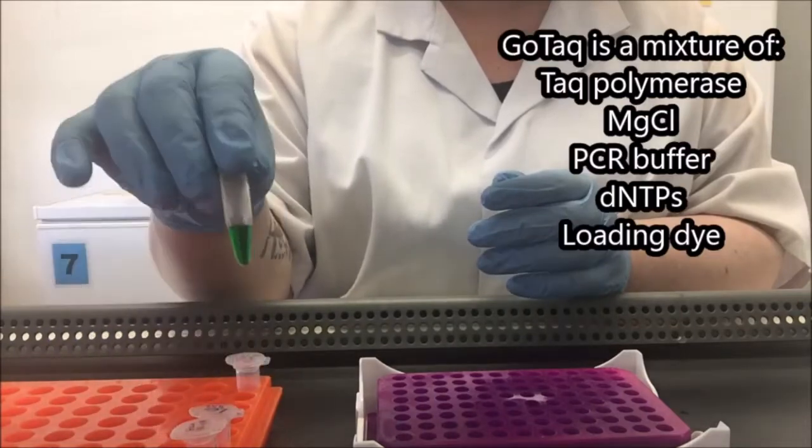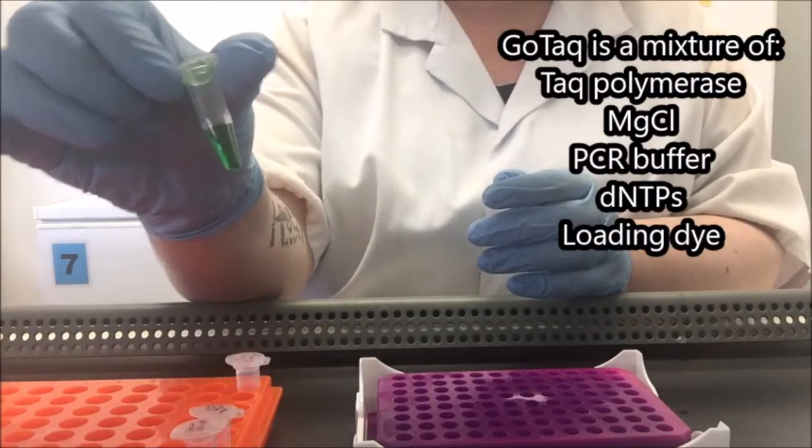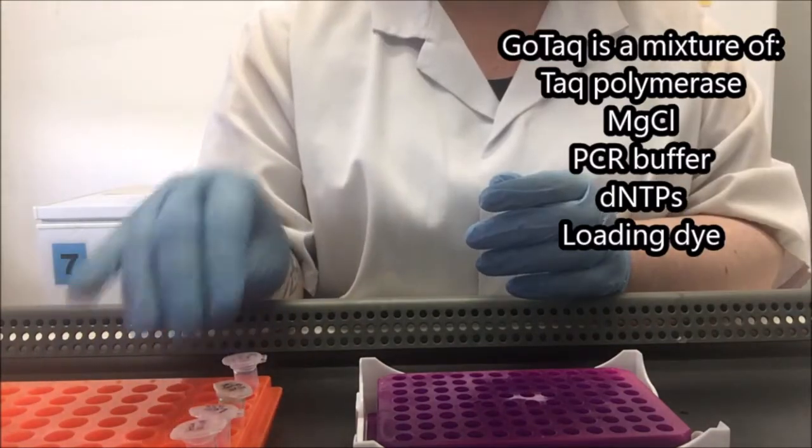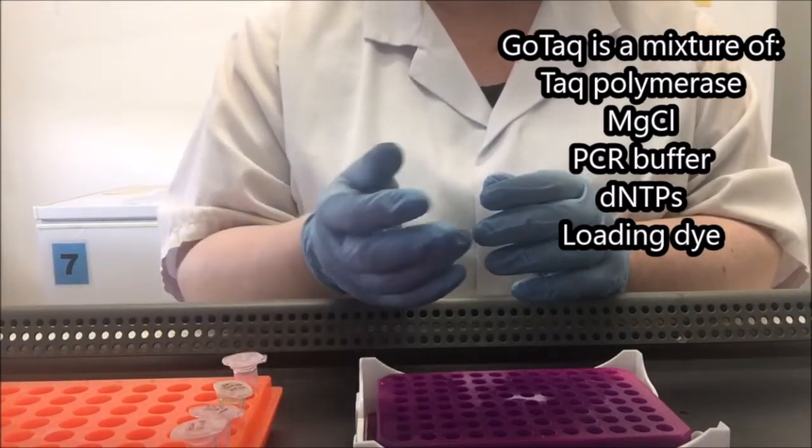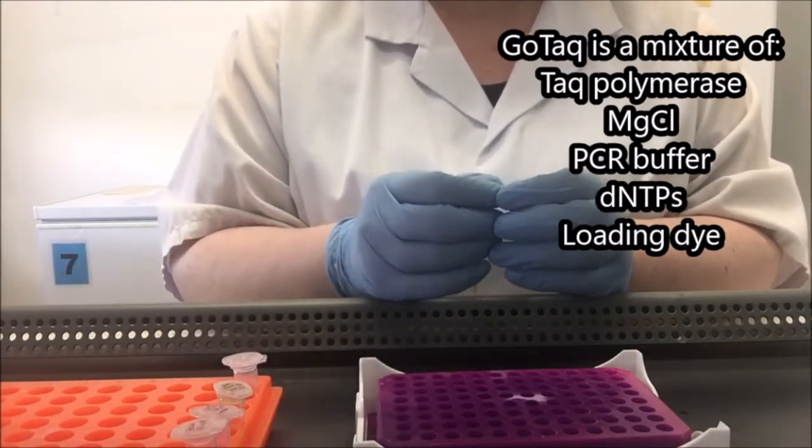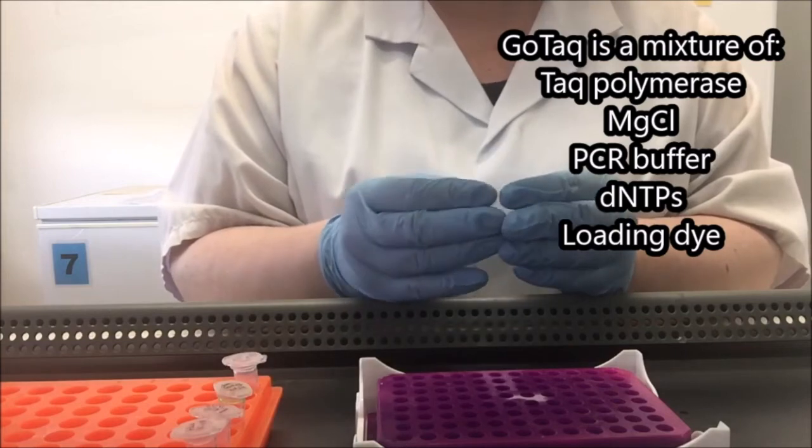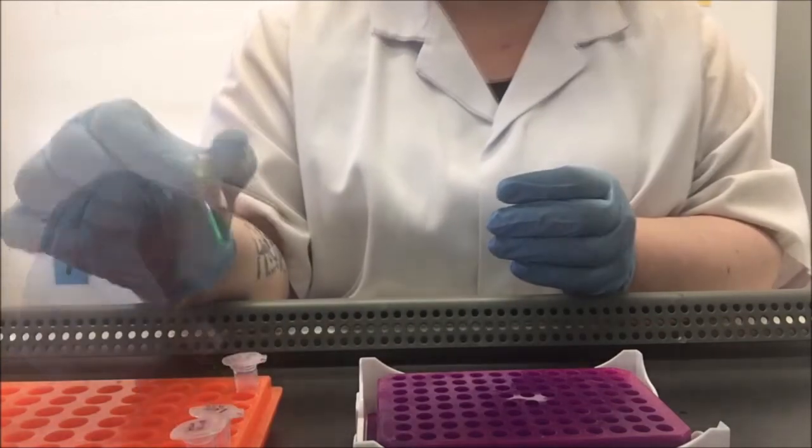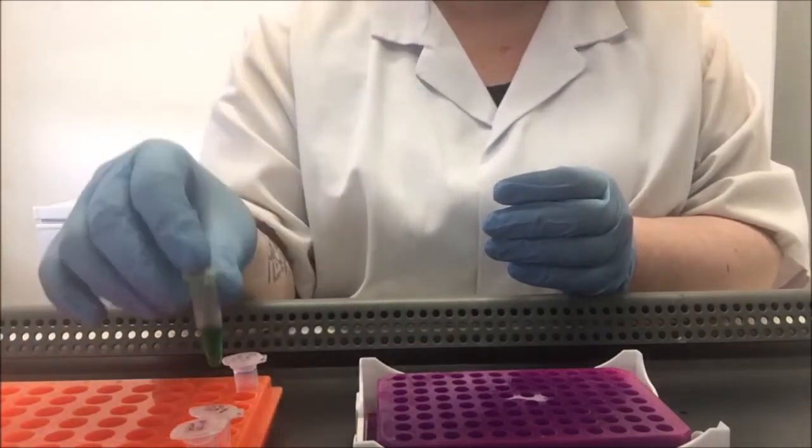In this case, I'm using GOTAC, which is this green colour. This is a master mix. So in addition to being TAC polymerase, it contains dNTPs, magnesium chloride, buffer, and a loading dye that will become important in a later step.